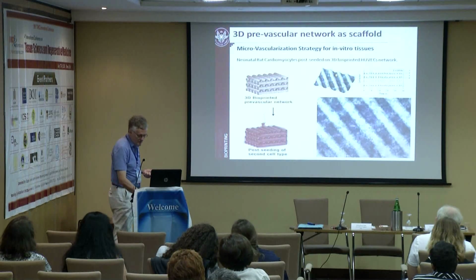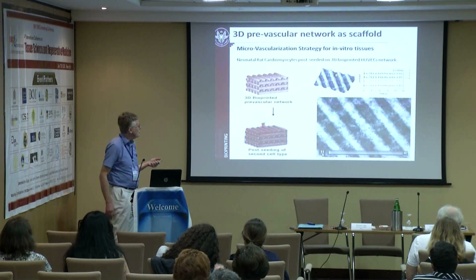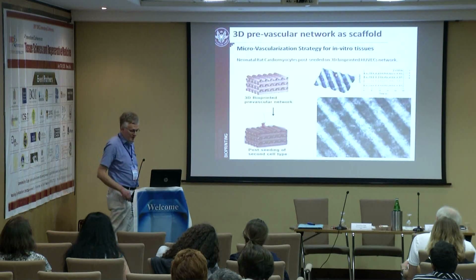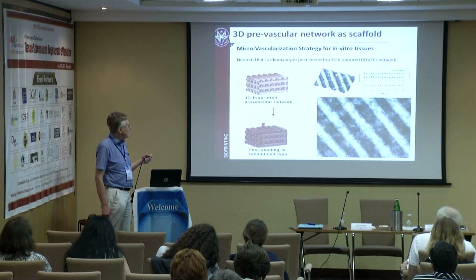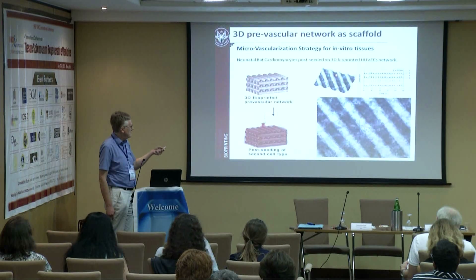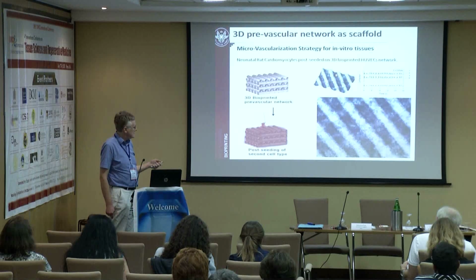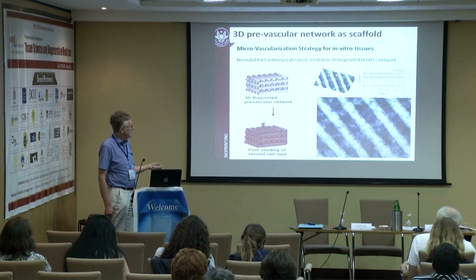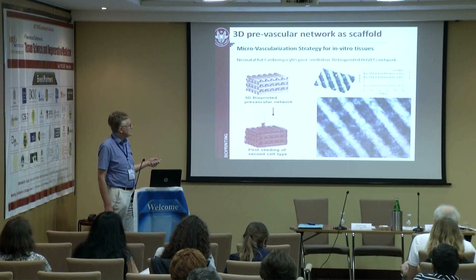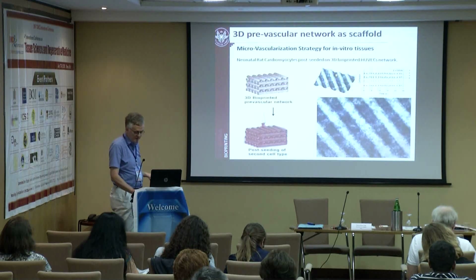So to assess whether this biomaterial could serve as a platform for in vitro cardiac tissue engineering application, we seeded the primary cardiomyocytes on top of the bioprinted scaffold containing human cells. After 2 days of culture, the cardiomyocytes started beating synchronously, as is also shown in this graph, where the beating frequency was monitored in 4 different spots, and as you can see, the profiles are very similar.